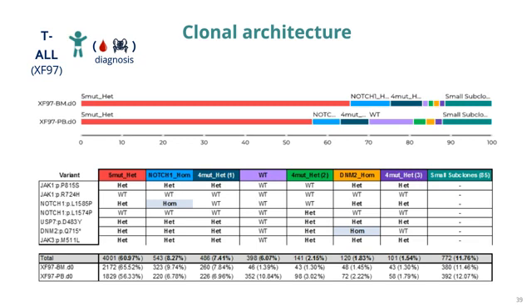Then another interesting information that we can obtain from a single cell approach is the zygosity of the cell. So we can really distinguish if a variant is either heterozygous or homozygous based on the variant allele frequency of each individual cell. So you can see that it's highlighted in light blue that we have 2 clones. The second one in blue has a homozygous variant for NOTCH1, and this is 8% of the cells, so it's the second major clone. And then we have another one, very small, in orange that contains a homozygous variant for the DNM2 gene.